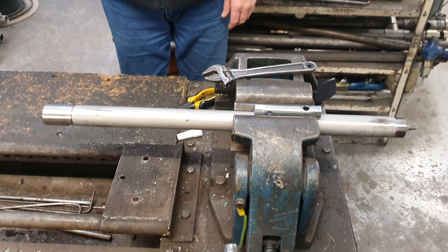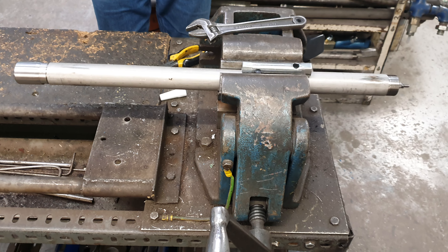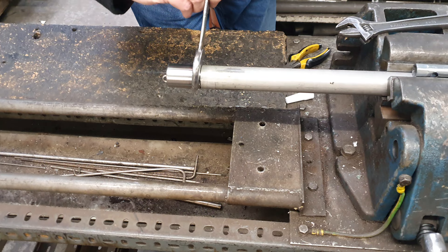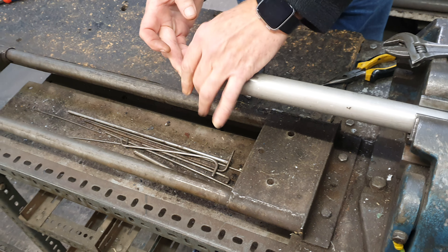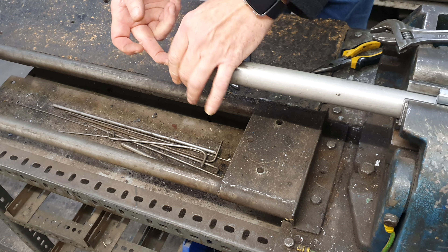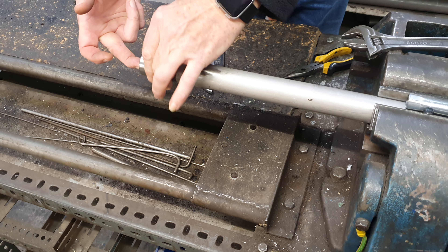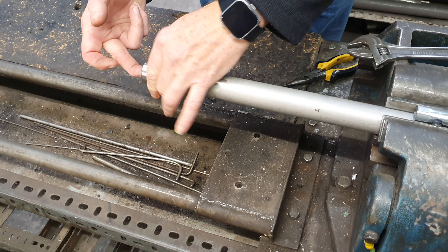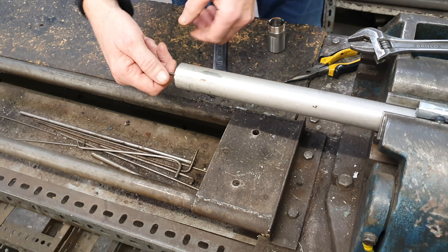Instructions to replace the ceramic insulator on the front 500 millimetre tube assembly. First, remove the burner head, keeping the electrode in the centre of the burner head so it will slip out through the centre of the burner head.